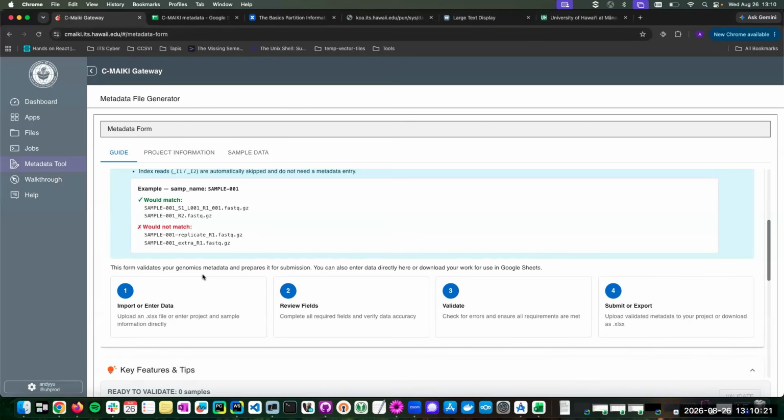So I think most people in here know me as the MGAL, molecular person building libraries. So if I understand, your classic 16S and 18S pipeline were specifically built for the EMP protocol, which uses Golay barcodes. And I know that you have demultiplex on there, but most people using this are probably just getting the demultiplexed data and plugging it in. I know that sequencing primers are different. You have different sequencing primers for EMP libraries and Nextera libraries.